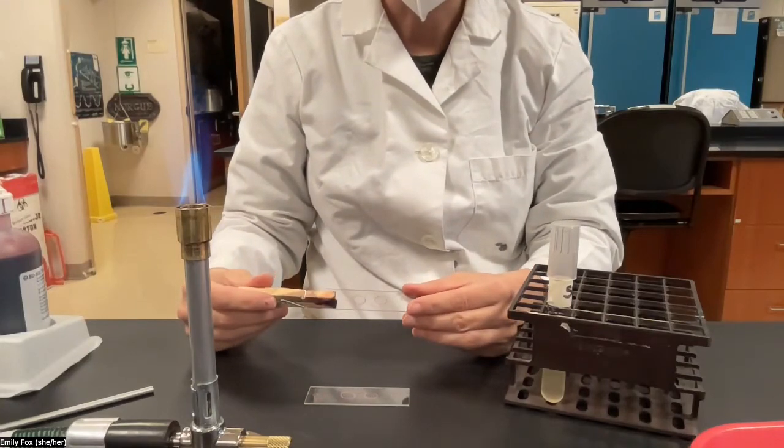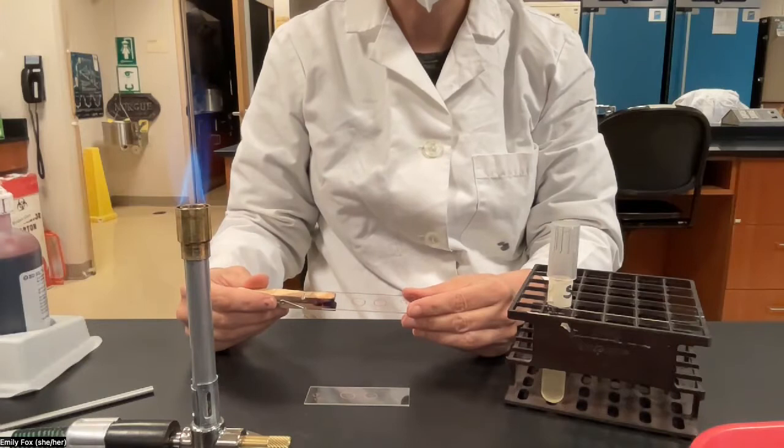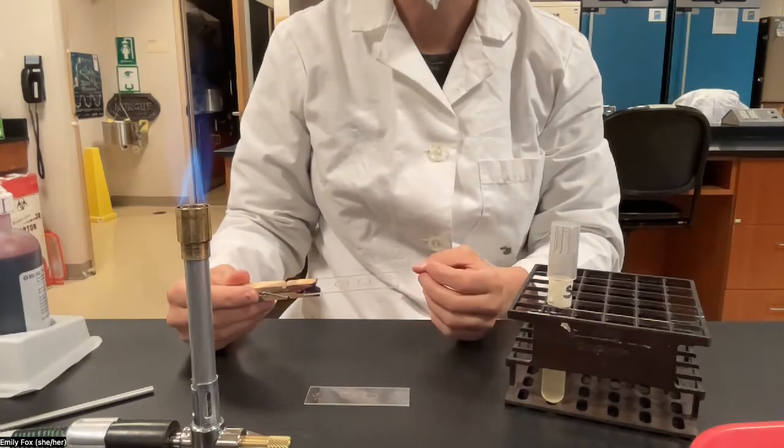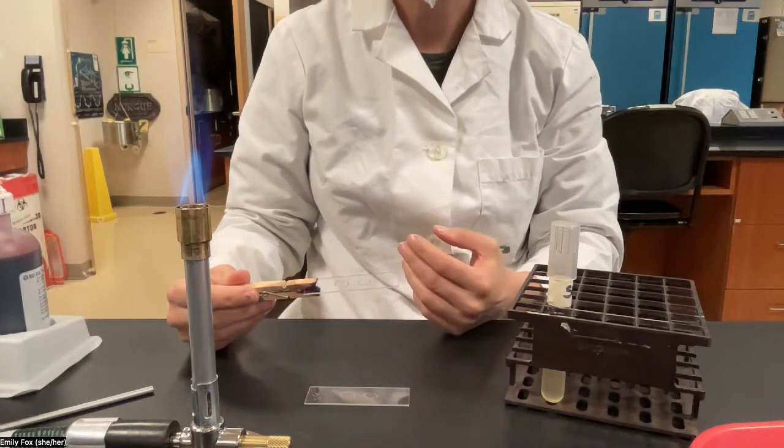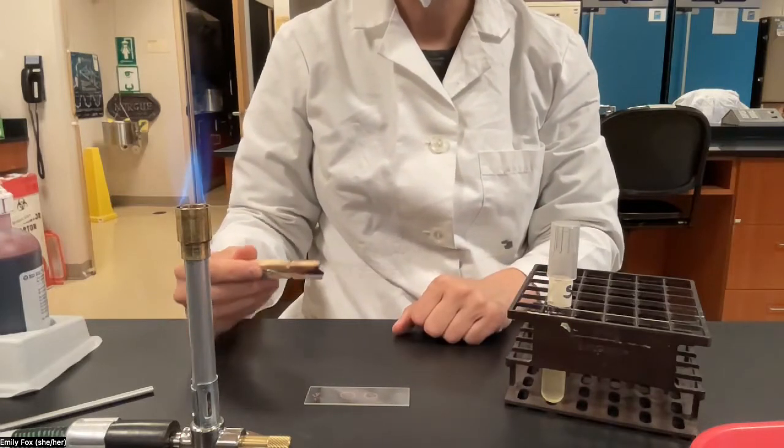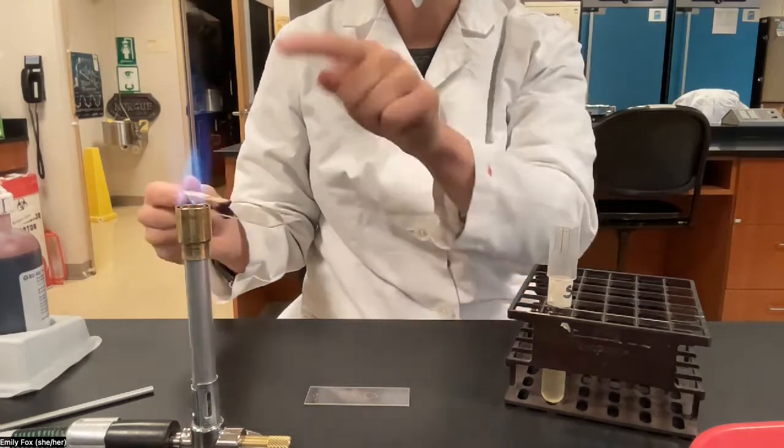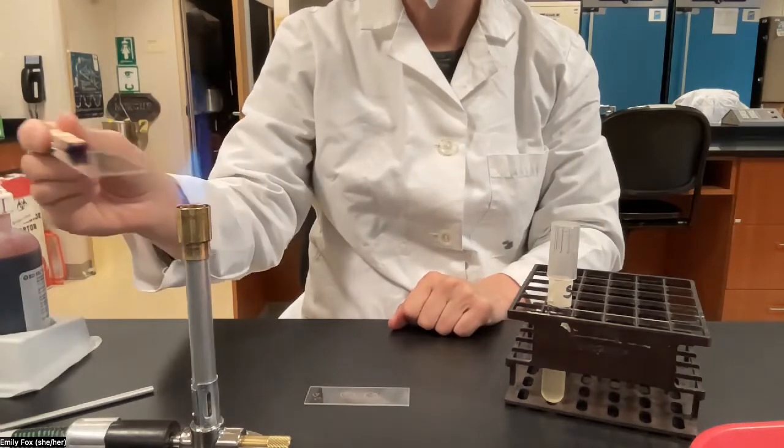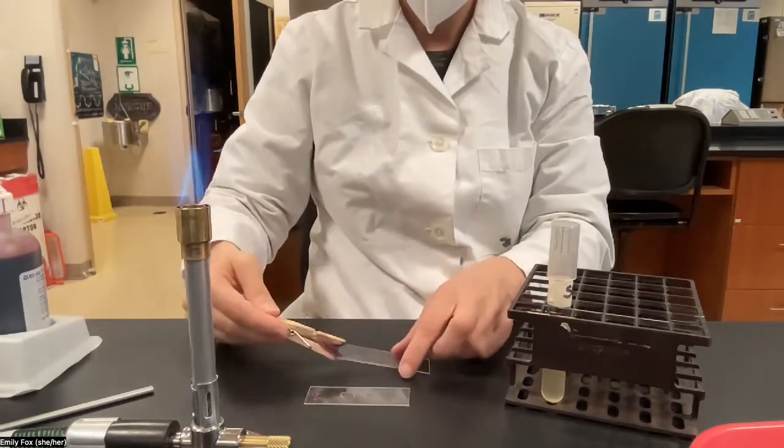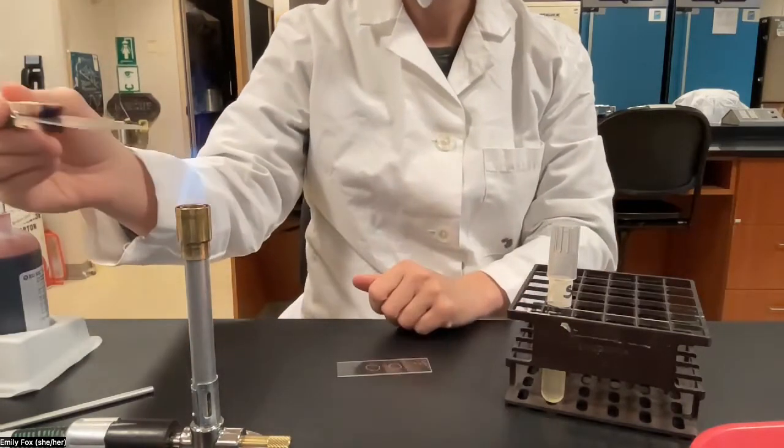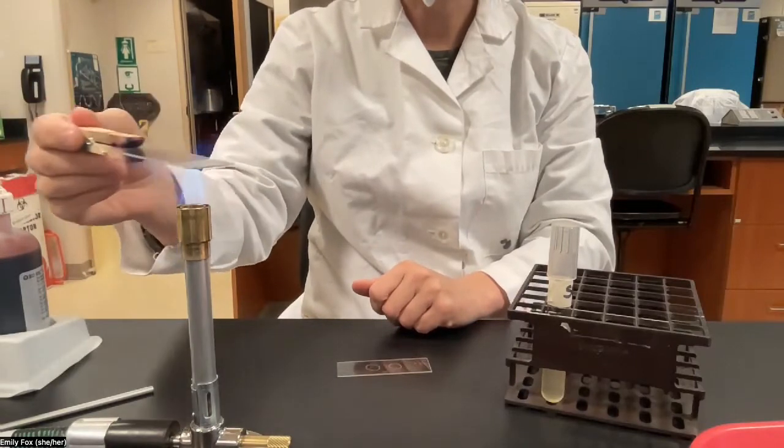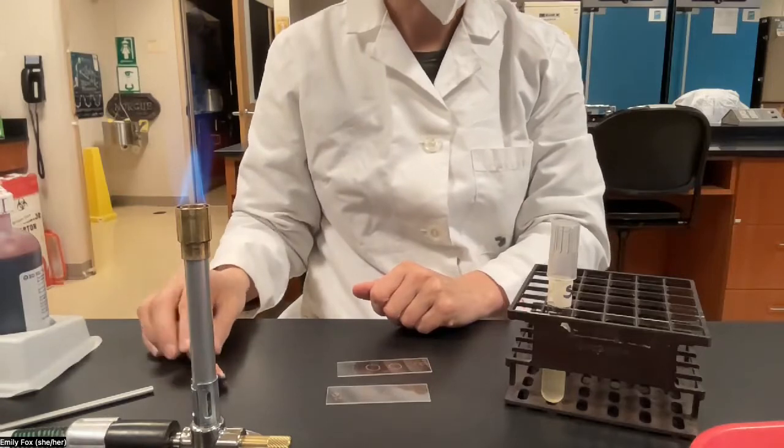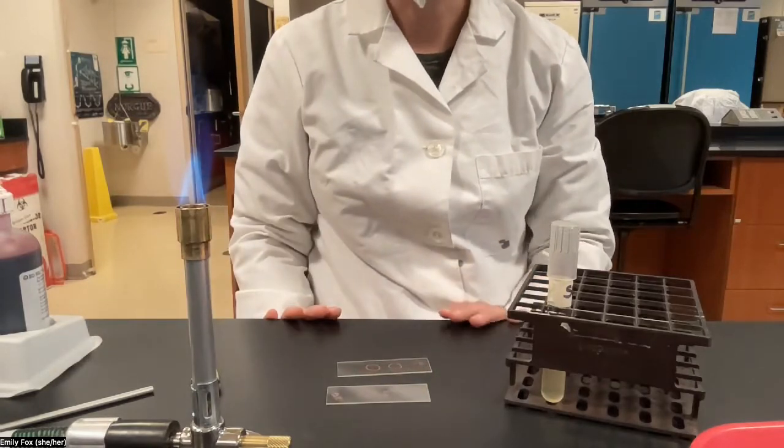it's time to do your heat fix step. This is a really important step. It causes the bacteria to stick to the glass slide so that when you do the staining and the rinse steps, you don't wash the bacteria off your slide. So the heat fix, we're going to pass the slide through the flame four times. One, two, three, four. Let's do both of our slides. And the bacteria are on the upward facing surface. All right, we are ready to do the staining.